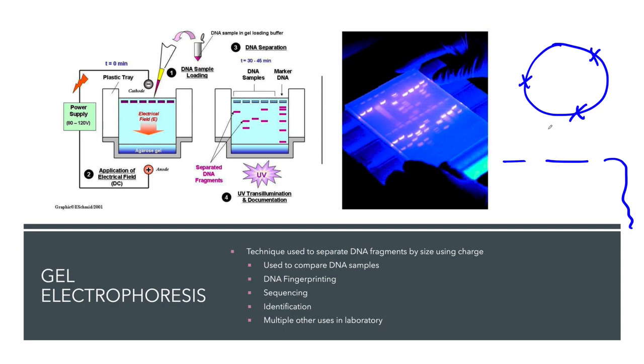Now I've exposed this plasmid to the restriction enzyme in a small tube with liquid in a buffer. And the problem I have is I can't see these fragments and I want to be able to see them. So I take my sample and I load it in a gel. Over here on the left we have a drawing of a gel, and on the right is what an actual agarose gel or electrophoresis gel would look like under UV light with a dye.